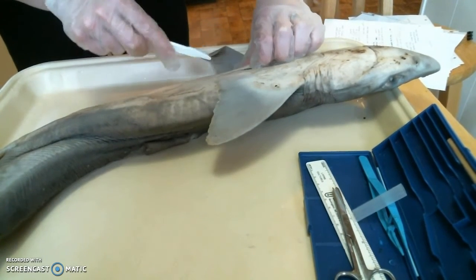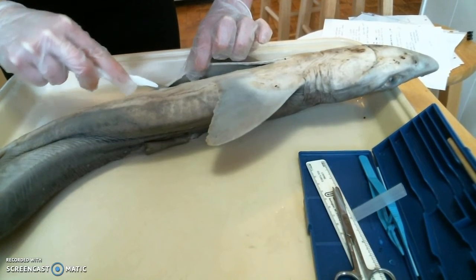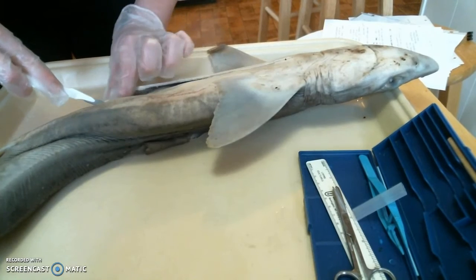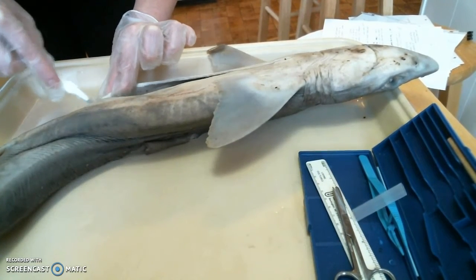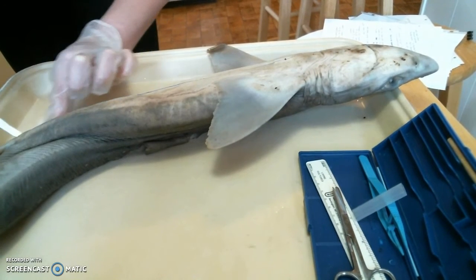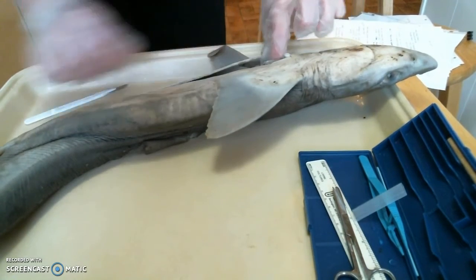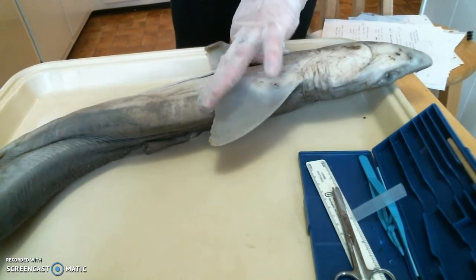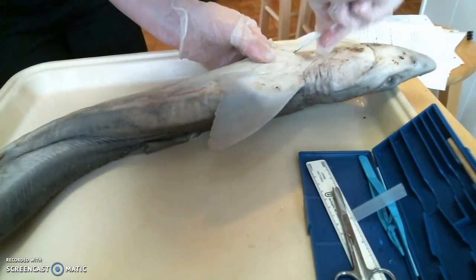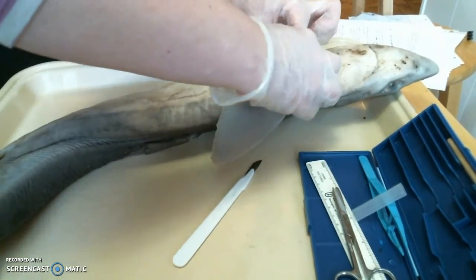Yeah, I've cut a little too deep, but I don't think I've damaged anything. There's the skin now that I can see coming apart, and try to cut about that deep. Because I can see I've cut the liver a little bit. Okay, so now I should, okay, so maybe I didn't, oh, at the top I didn't cut deep enough. It looks like the skin is thicker up here. Yeah, that's interesting. The top is very thick up by the pectoral fins. There's a little membrane there.